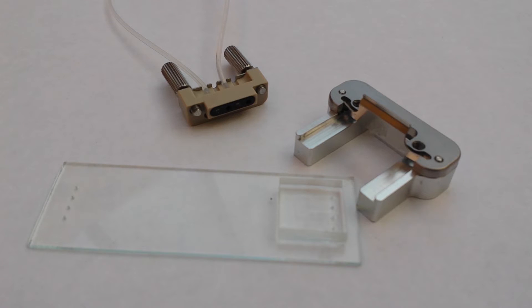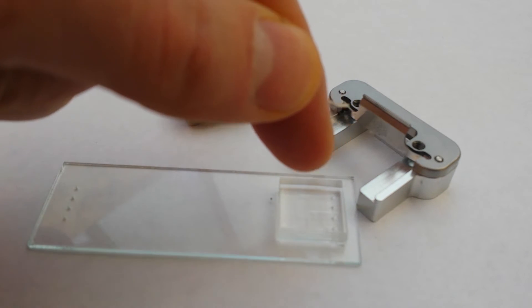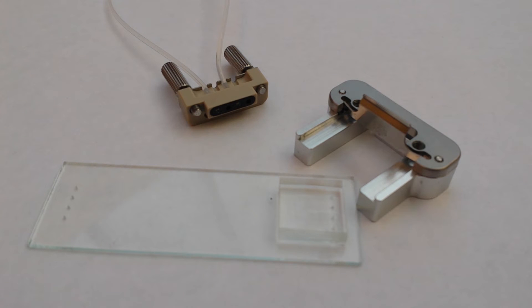With this particular device, they've got four holes here, and they've designed the inlet to actually twist around and come out on the same side. That's good because now you only have to make connections on one side, which is a lot more intelligent in terms of designing microfluidic devices.